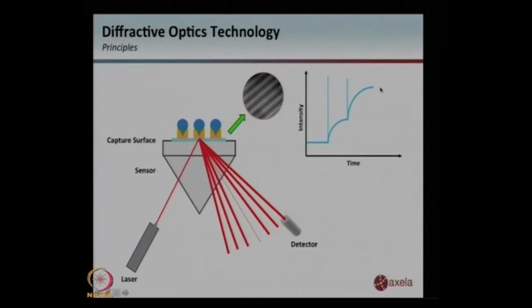So the good thing is multiplexing is possible in that way. We can talk about multiplexing in a different one. This one is basically one molecule binding to another molecule. You can also bind a second one. Sure. So you can imagine an antigen and an antibody and a secondary antibody.